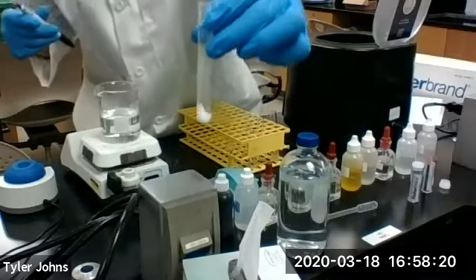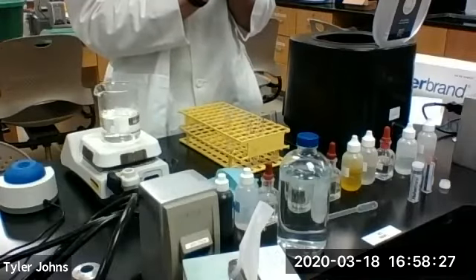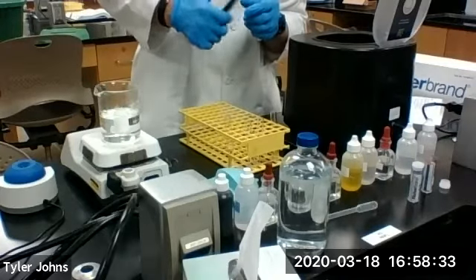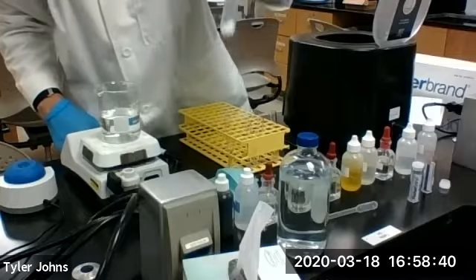The precipitate will be labeled as R14 for residue 14. And with residue 14, we're going to analyze for barium and calcium ions.